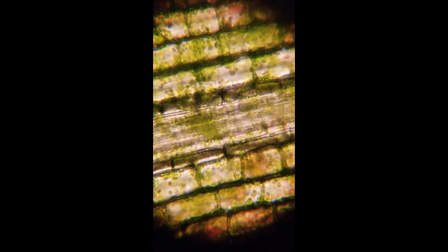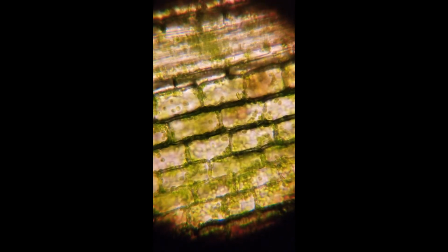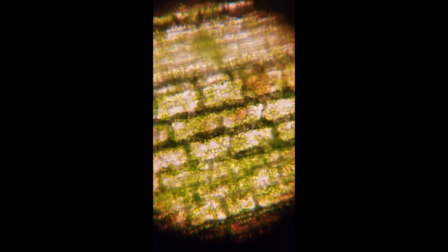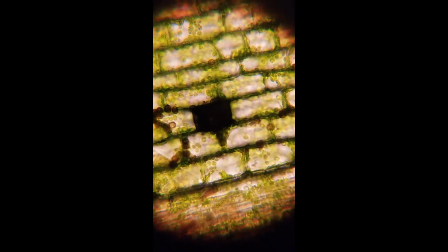But at least inside of each cell, you can also see chloroplasts moving around. I'm just changing the focal plane now to see every part of them. And if we wait a minute, you can see some movement within the cells too. And we have a hole. Look at that, a nice square hole. That's neat.